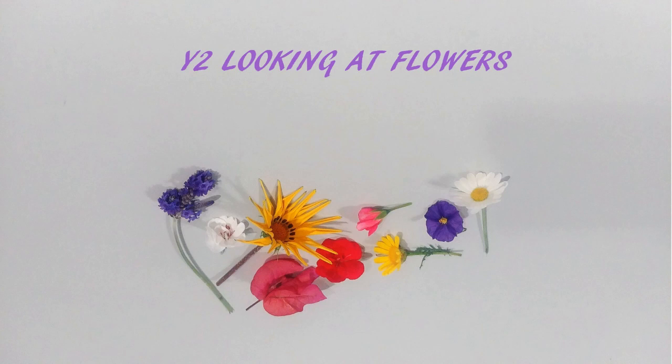Year 2, looking at flowers. A flower's job is to allow a plant to reproduce. In this video, you are going to see a plant dissection. If you carefully cut up a flower, you can find the parts involved in sexual reproduction.